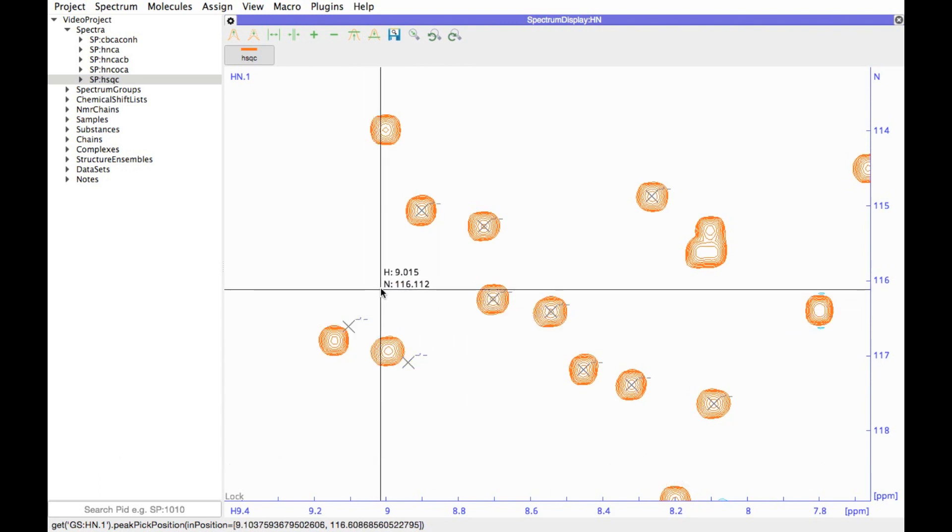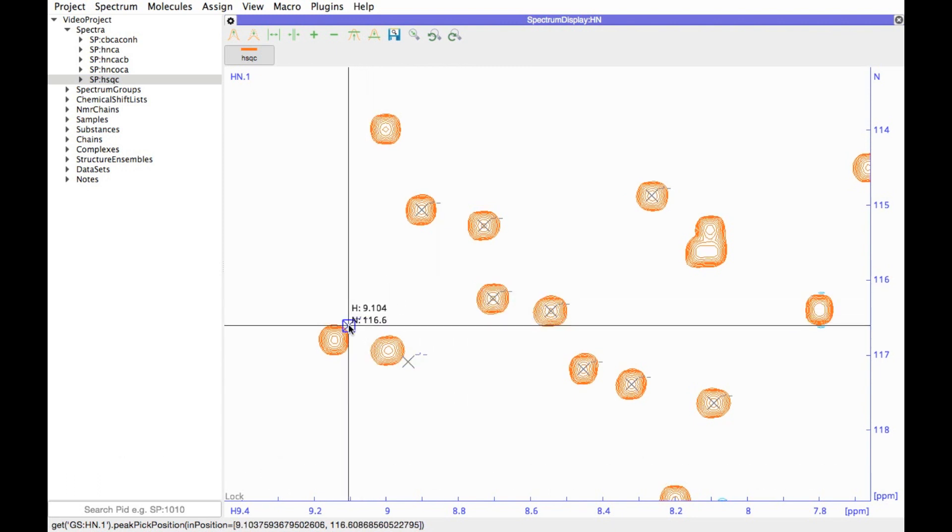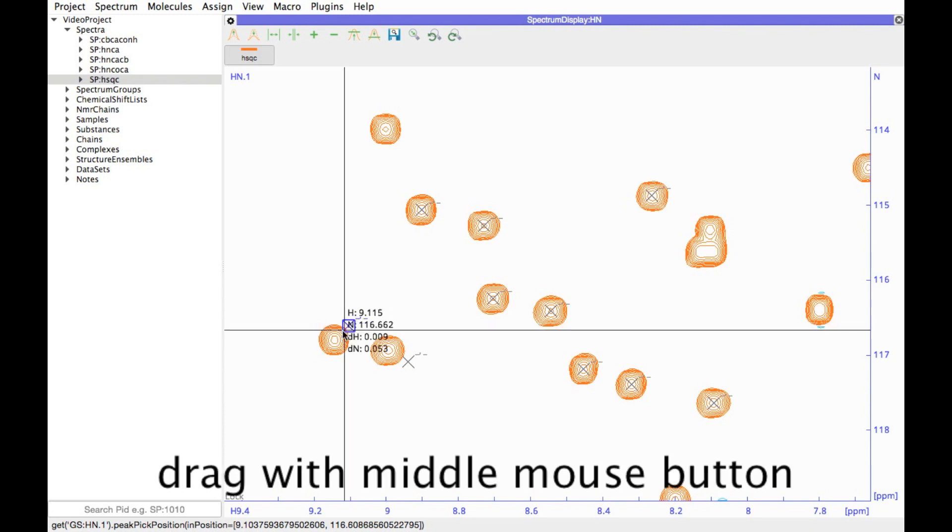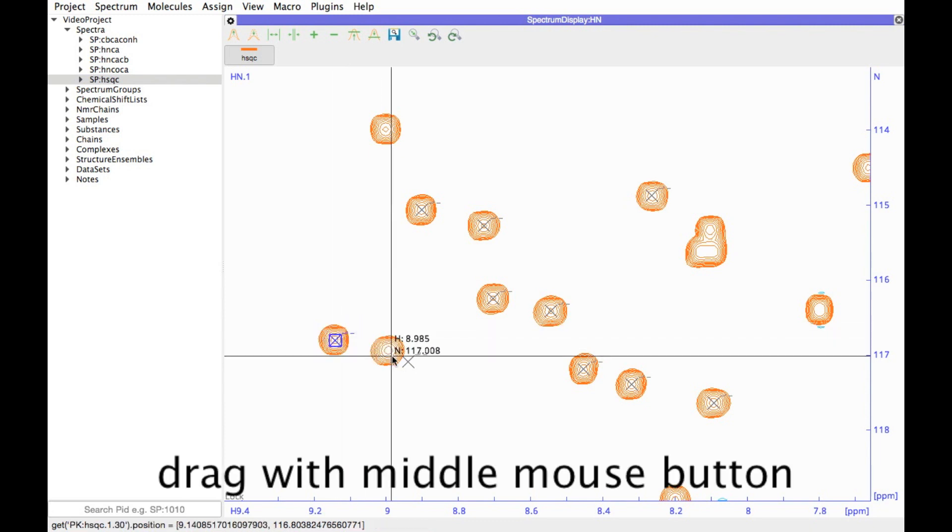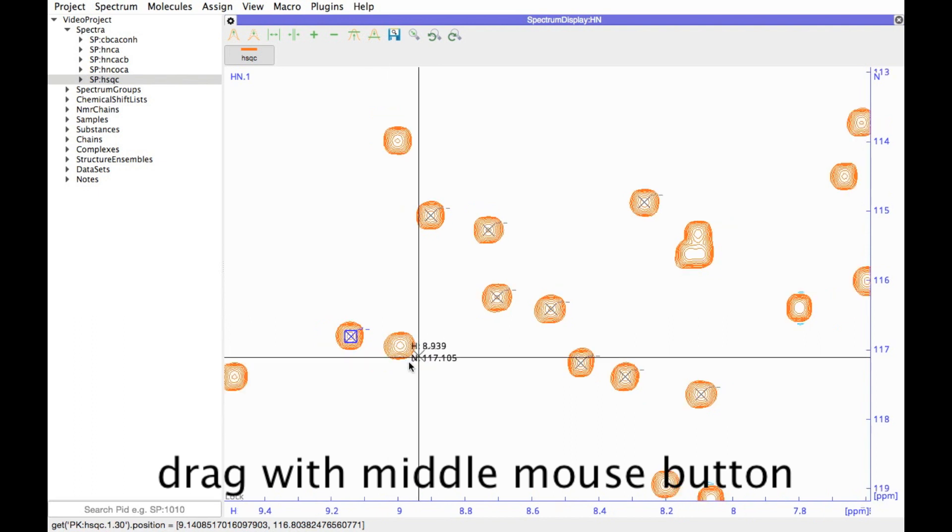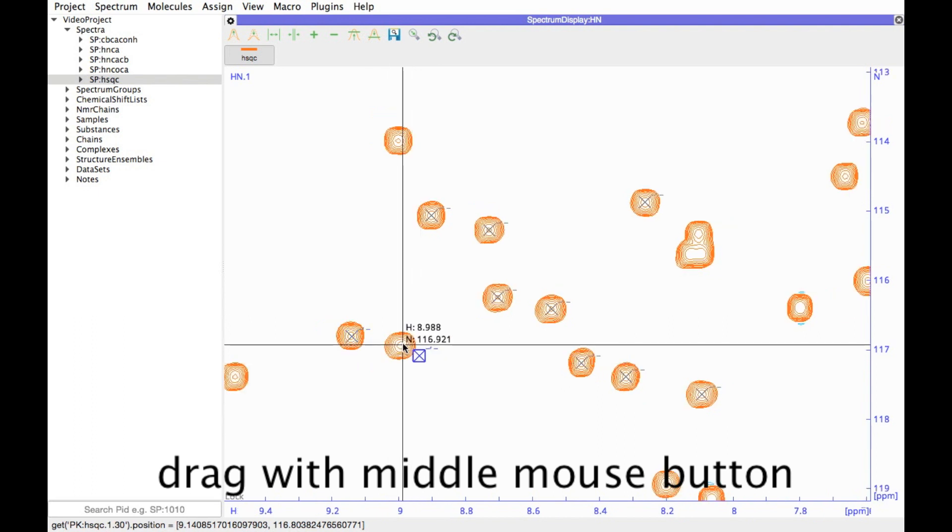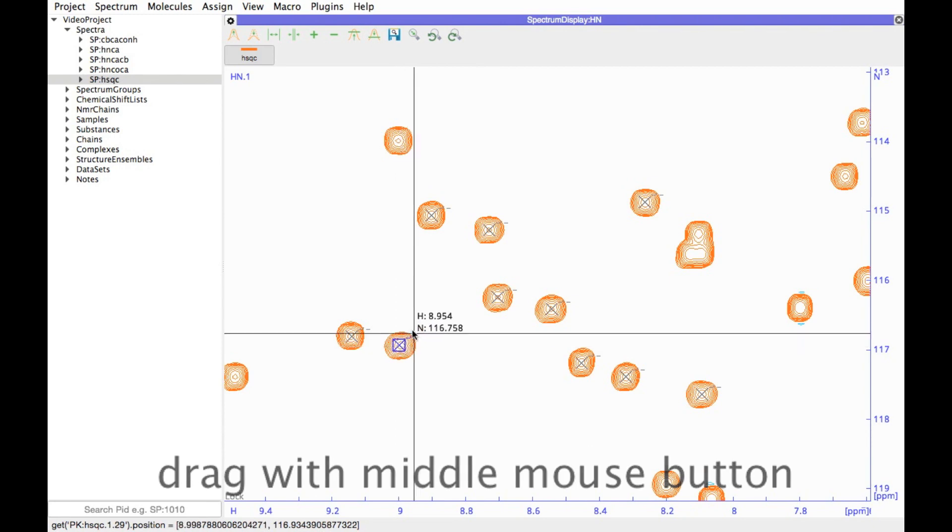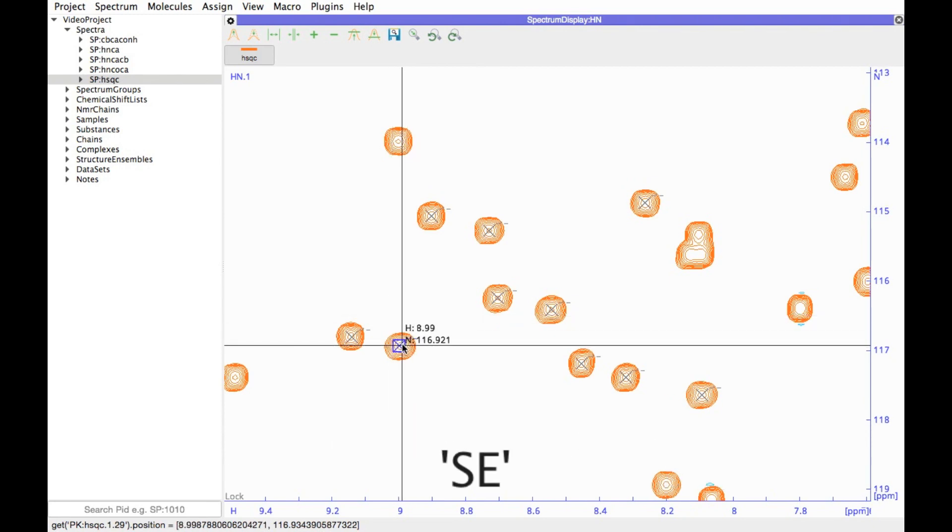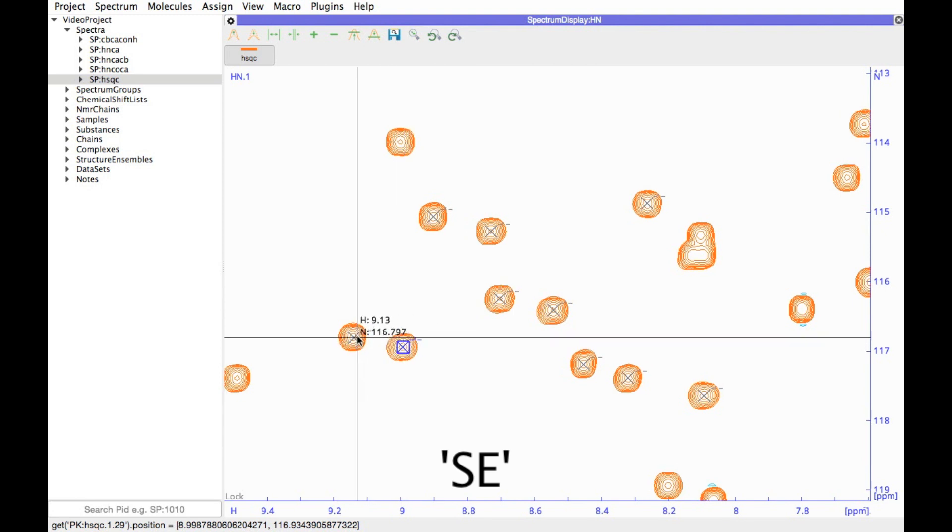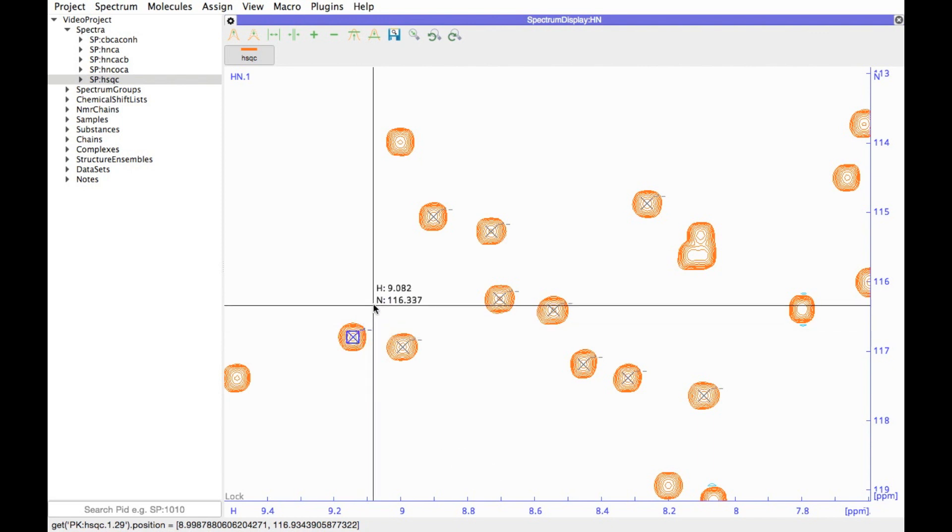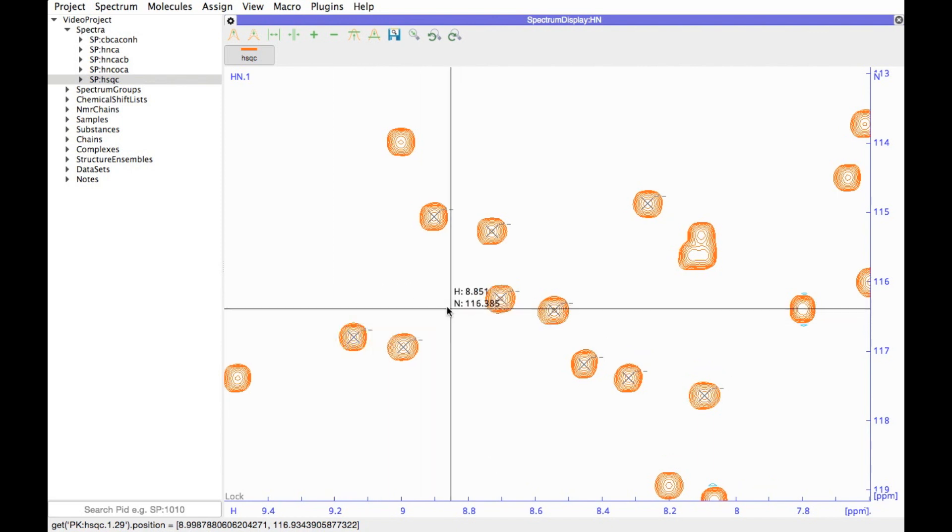If you then decide you want to move them, you can select a peak and then use the middle mouse button to drag it to wherever you would like it to go. If you use the keyboard shortcut SE, incidentally, you will move the peak to the local maximum. If you want more information about picking peaks, then have a look at our peak picking video.